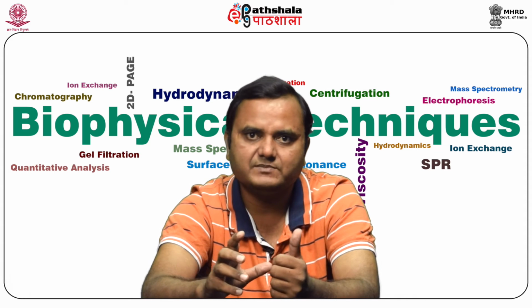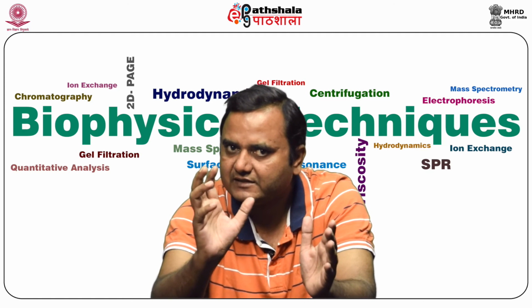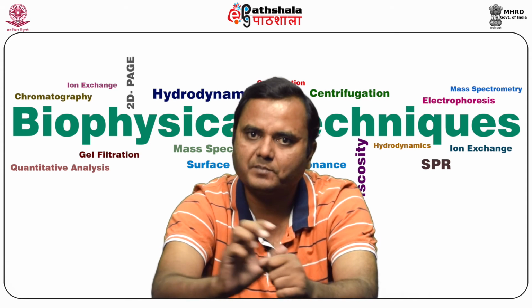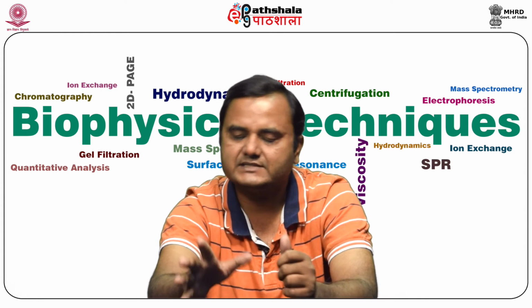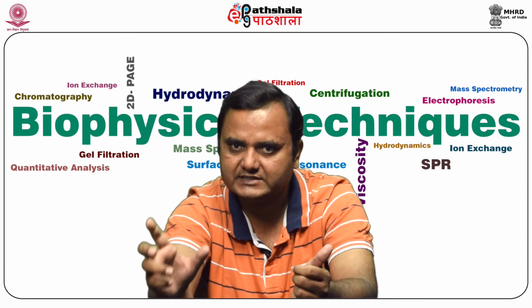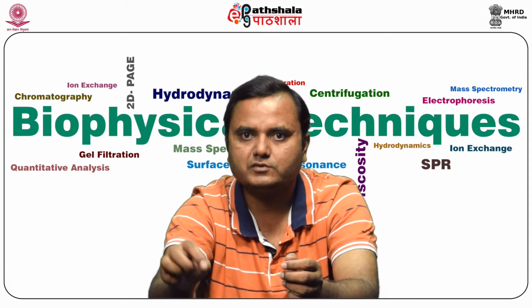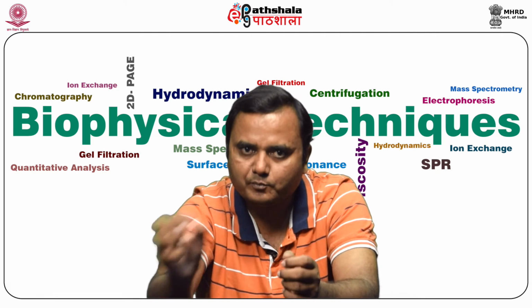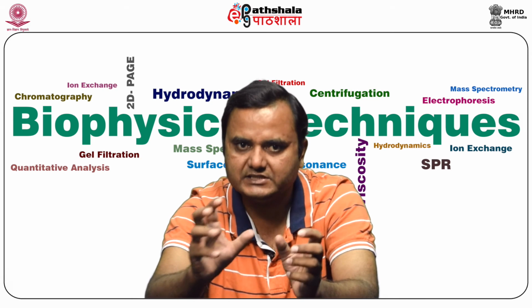The size difference between the particles affects the separation along with the density of the particle. So in rate zonal centrifugation, we take size as well as density of the particle into consideration, and they are the two important factors for the separation of the particles. Larger particles move faster through the density gradient than small particles, and the density range is chosen so that the density of the particle is greater than the density of the medium at all points during the separation. The run is terminated before the separated zones reach the bottom.